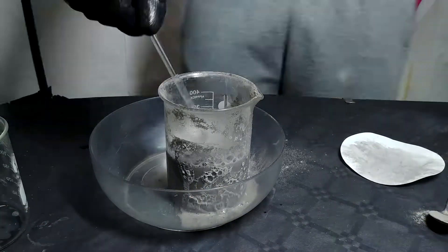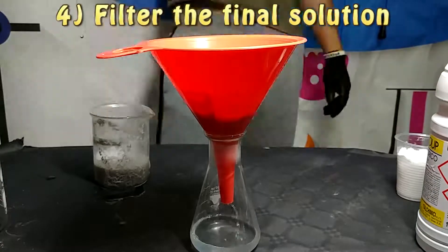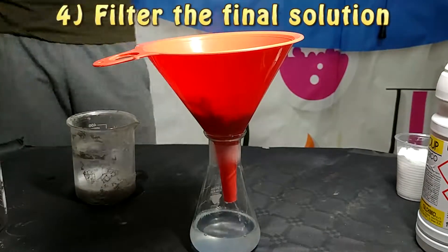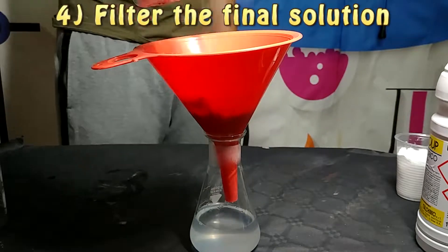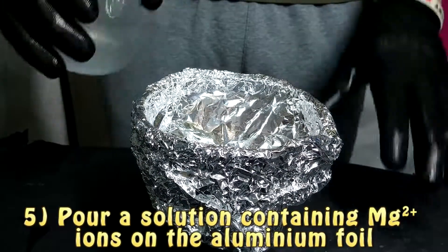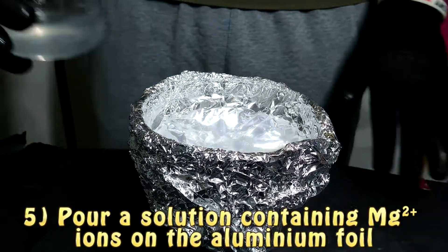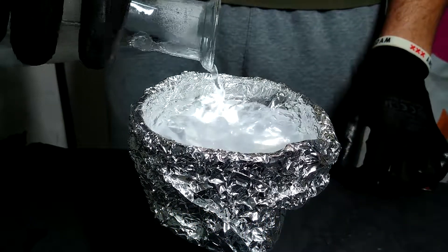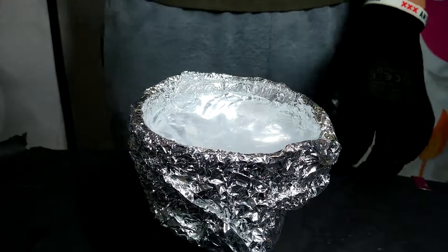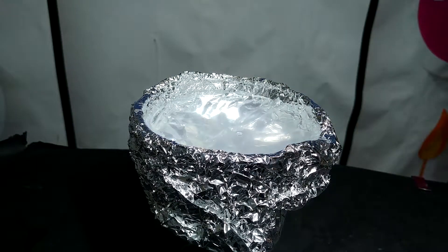The result from this experiment is that aluminium tends to stay in a metallic form much more aggressively than magnesium, and that's why the reaction does not happen. We can also deduce that if we mix a solution of aluminium ions with solid magnesium, the reaction does happen and solid aluminium is produced.